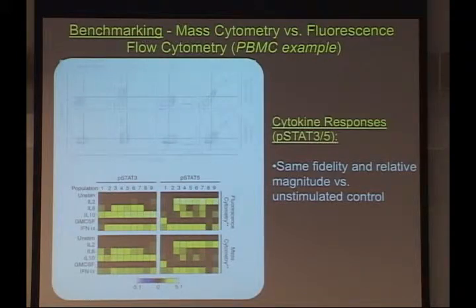I don't have to put it on the board, but here what we did instead is we did the arcsinh difference, or it's kind of like a log difference. The reason we did that instead of fold change is, unfortunately, or fortunately, I don't know if it's good or bad, with mass cytometry data, with the negatives actually being 0, with your unstimulated cells having no measurable signal, fold change versus 0 can get a little crazy. So dividing like 100 counts versus 0.1 counts, you can get an unusually large fold change.